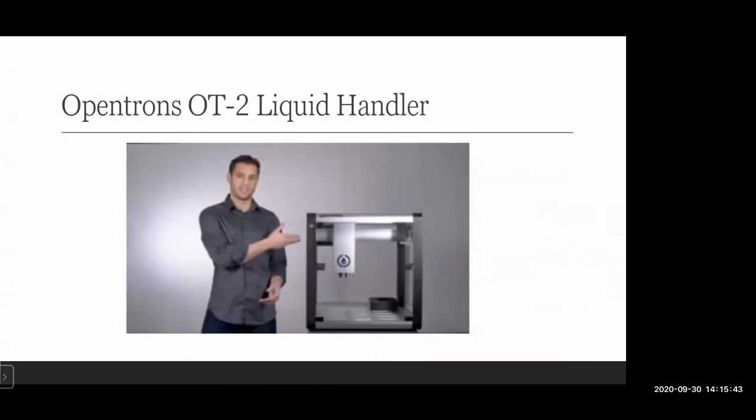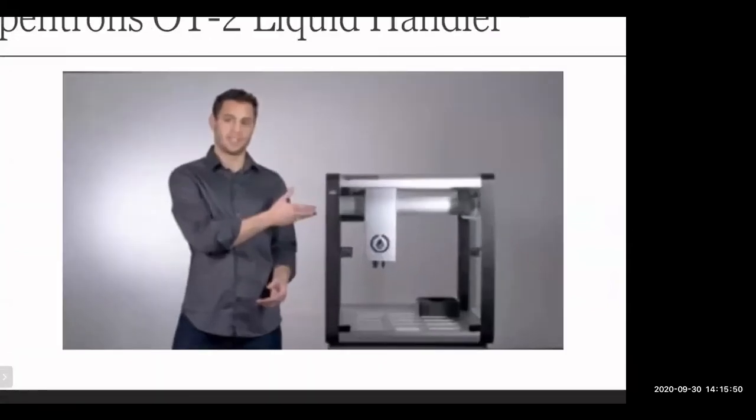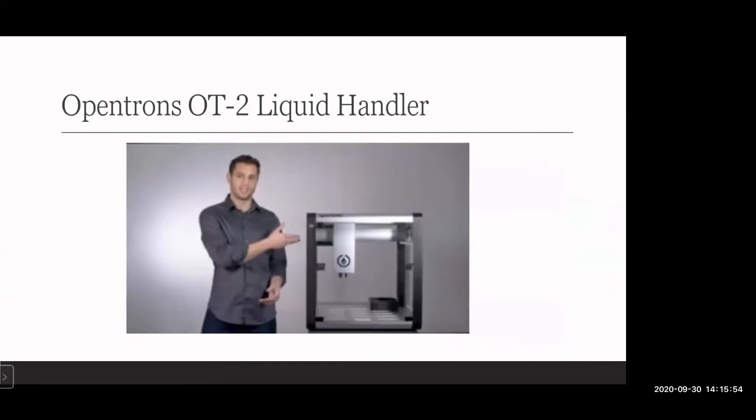And here I have the Opentrons liquid handler. I have a video for you to watch to see how a device like this works. Apparently I can't play it off my tablet, so now that you have the PowerPoints, you should be able to watch this in your free time whenever you get the chance. Essentially, it doesn't offer anything like the previous projects had in terms of incubation or measurements, but it's able to dispense fluids in large capacities. If you think of a 384-well plate, which is often used for measurement experiments in biology, manually pipetting 384 wells by hand is very tedious and very long, and it's prone to errors sometimes, given human handling.